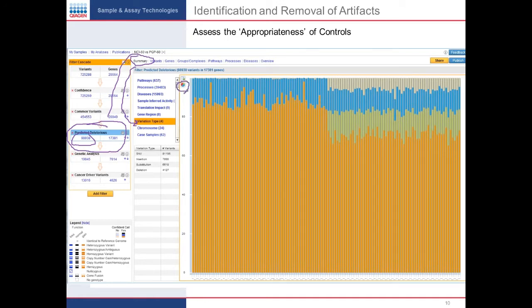And this is a button my colleague made me aware of. By default you get the pie chart, but if you click here, there's a bar chart symbol. If you click on that, it'll show a bar chart where each bar is one of my samples. So the way this breaks up is, let's see if I can draw a straight line through here.